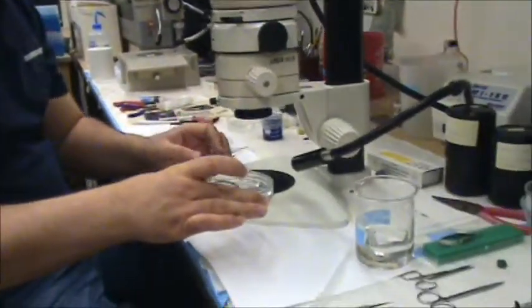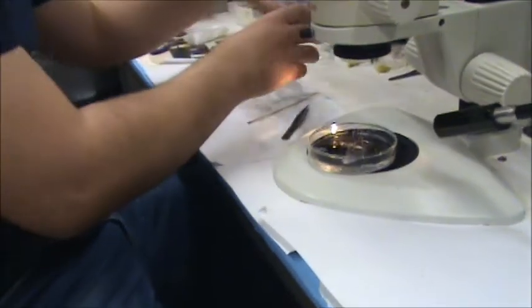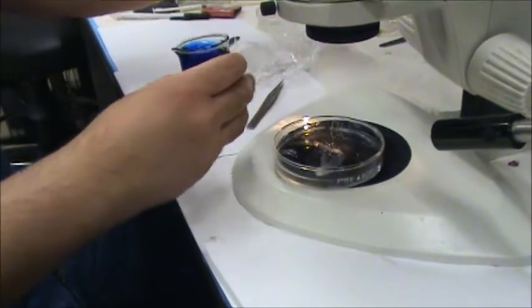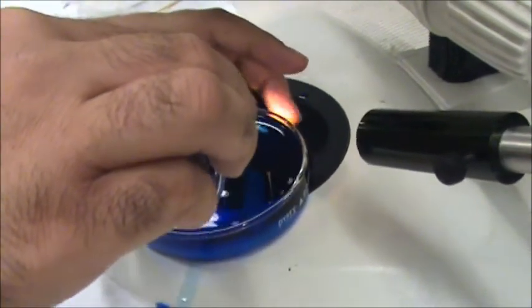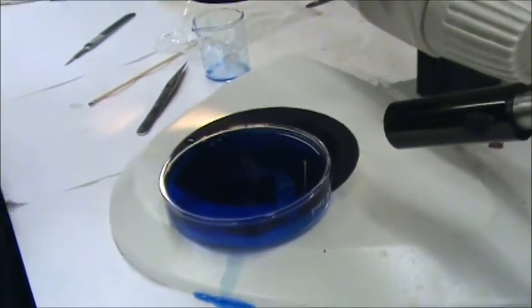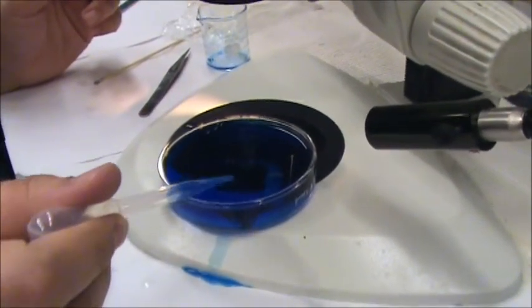Now I'll pour the saline into the saline beaker. Then I will use a cold methylene blue to stain the nerve fibers here. Then I will put it inside the refrigerator for 10 minutes because cold methylene blue is good and it stains the nerve fibers very well, and we can do this many times before putting it inside the refrigerator. Then if there's something here, we can remove it. This is the tendon and muscle fibers. Now it's ready to put inside the refrigerator for 10 minutes.